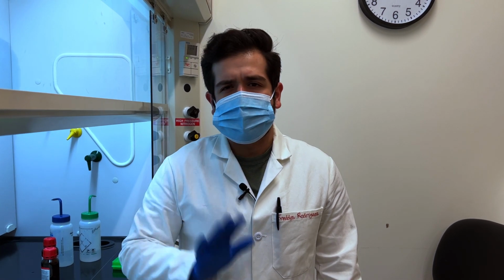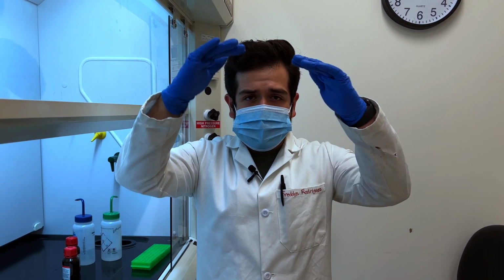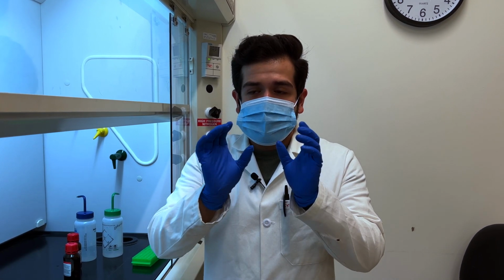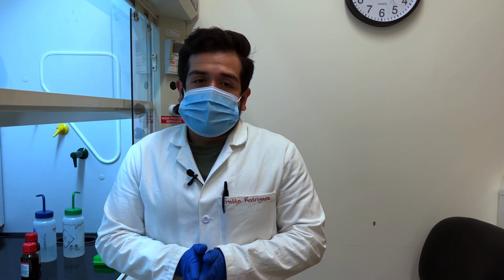But once this step is done, all you have to do is wash it really well with water, and you'll be able to tell that the siliconizing is done because the glass feels a little bit oily. It feels like you can actually run your fingers over it very smoothly. The other way is, of course, when you start washing it with a lot of water, you'll see that your water, instead of trickling down, it actually bubbles up.